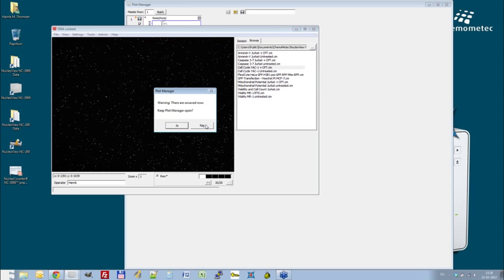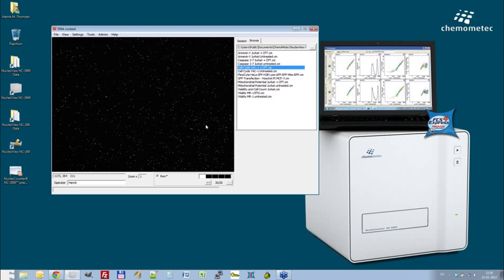All this is very nice and very easy if you have a few samples and you want to do a quick analysis of apoptosis or cell cycle, cell counting, and so on. But if you want to have presentation tools like FCS Express for images, or you want to do batch analysis, you will need to export these data. And we will always save the data in these samples here.